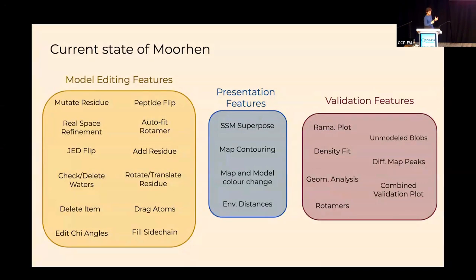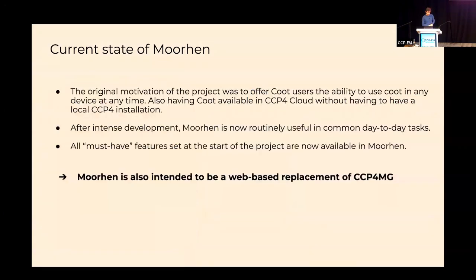But then again, that's just a basic list. The truth is, Moorhen, as of today, extends on that list, and I just couldn't fit all of the things that you can do right now in Moorhen, so just keep that in mind.